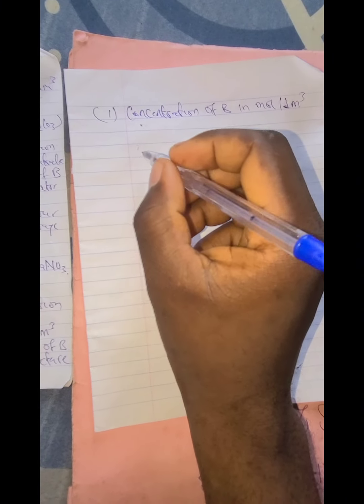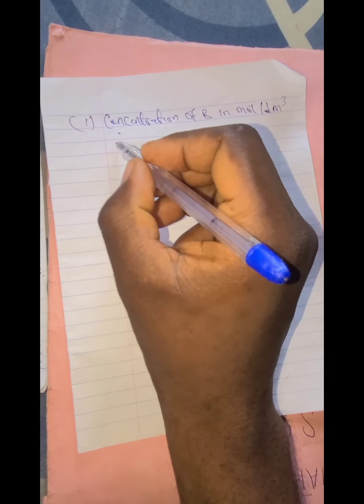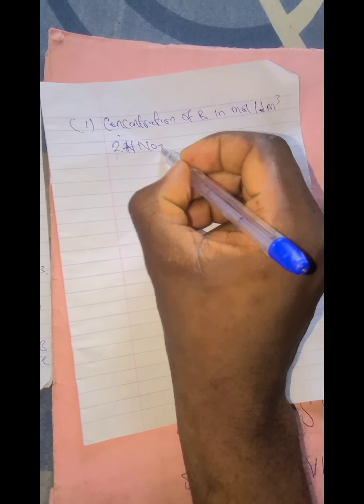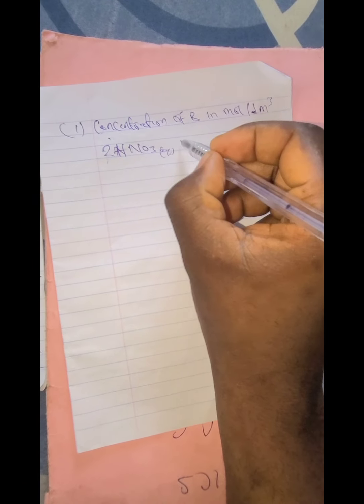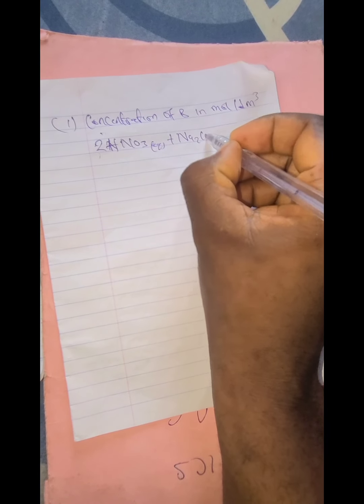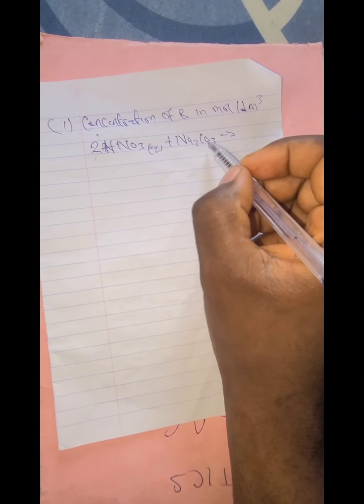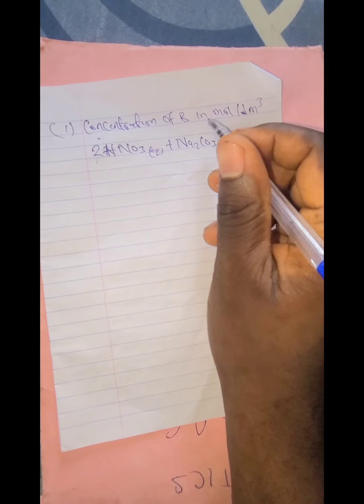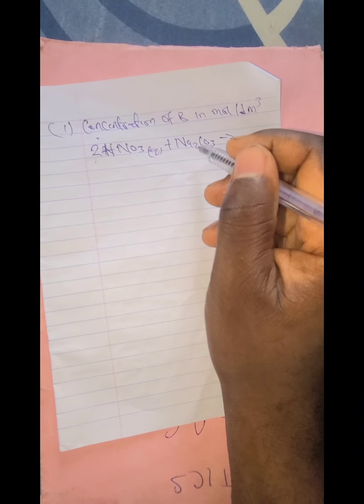First of all, let's write the equation for our reaction, although it has already been given to us. 2HNO3 aqueous reacts with Na2CO3. I know some of you will be wondering, why am I using only sodium trioxocarbonate(IV)? Remember, our base is a mixture of sodium trioxocarbonate(IV) and sodium trioxonitrate(V), but the sodium trioxonitrate(V) is just acting as an impurity.